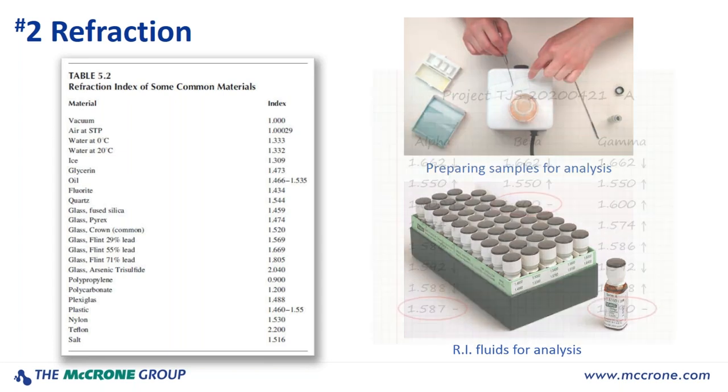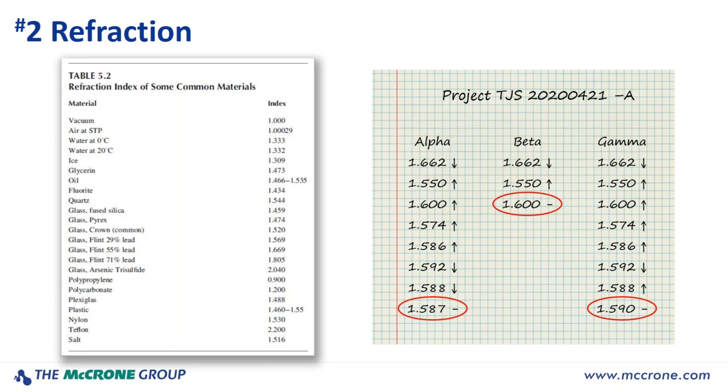And here you see an example of how I would have a single particle and I would have to figure out the refractive index by bracketing that particle in several different refractive index fluids across all 3 of the refractive indices. Fortunately, there is another method.